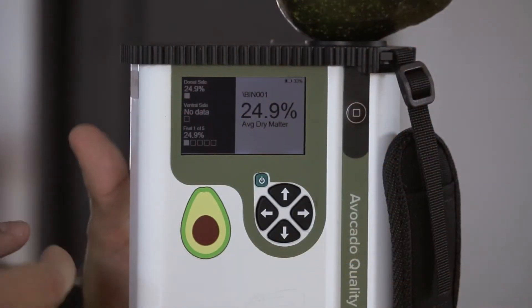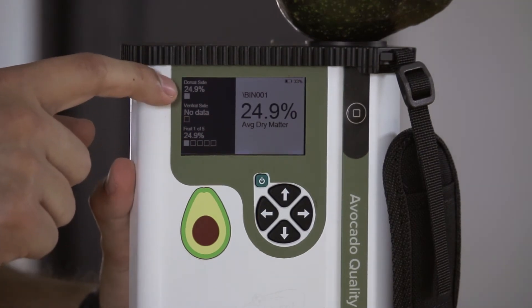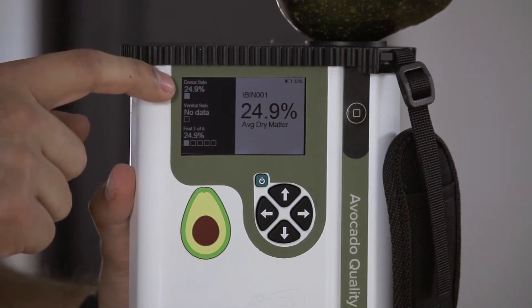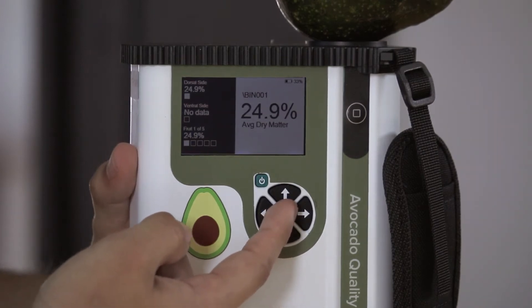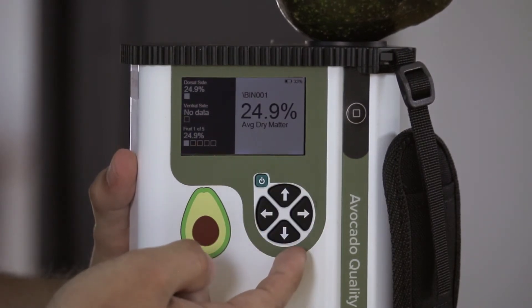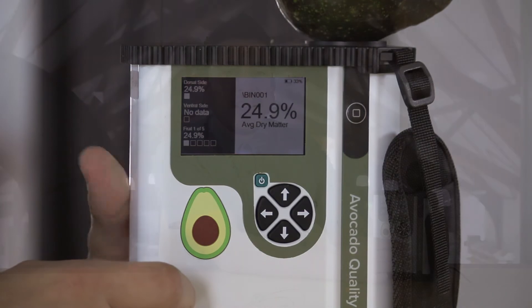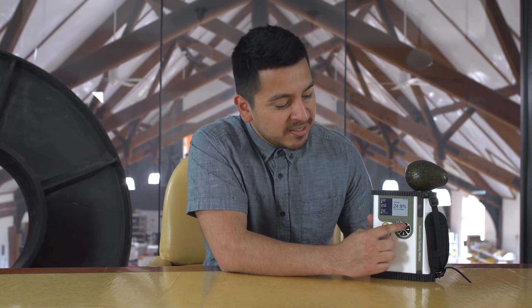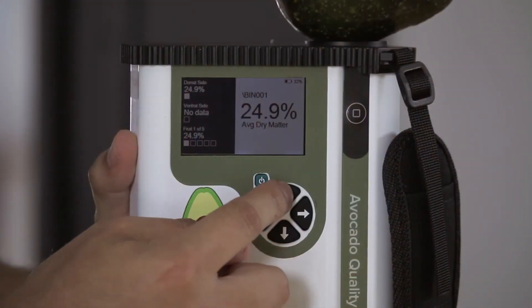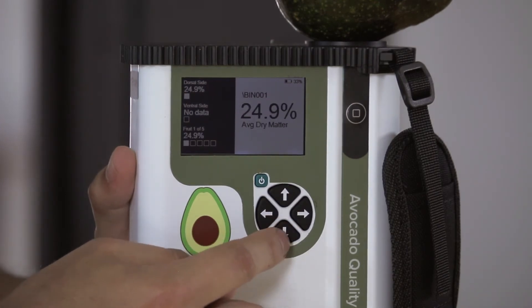Once the measurement is complete, you will notice the dorsal side measurement box has been filled with the result just above. The large number to the right is the average value of the lot as we progressively take more measurements. The standard deviation is also available and on display for all measurements. Lastly, it is very easy to toggle between lots. We can create a lot by using the up arrow and return using the down arrow.